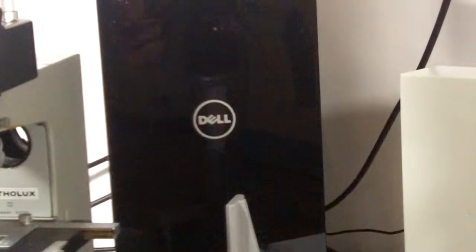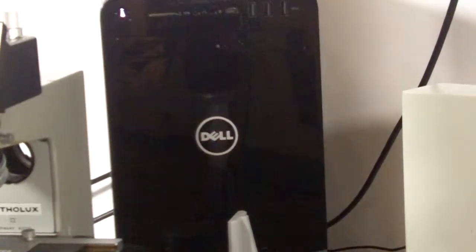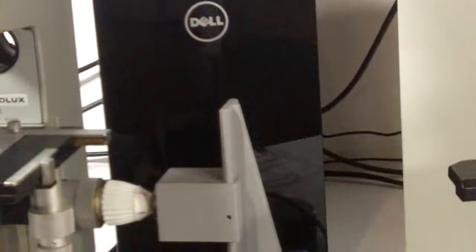But the Retro Zed itself comes with this stand and this control unit and a gripper cup of your choice that connects to the fine focus knob.